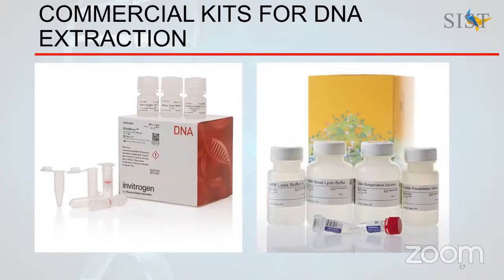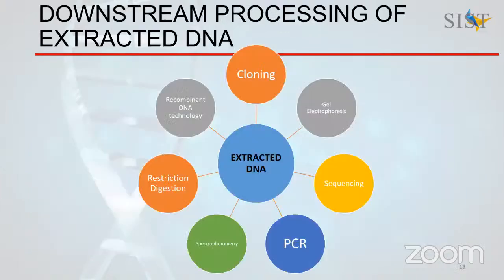So the next one is commercial kits available for DNA extraction. These commercial kits make the DNA extraction procedure easy, because if you do everything manually, you have to prepare every reagent, like the phenol, isoamyl alcohol, chloroform reagent, and the buffers you use. Everything should be prepared manually. But if you use a commercial kit, they are efficient and made in an accurate manner. So the obtained DNA at last will also be of pure quality.